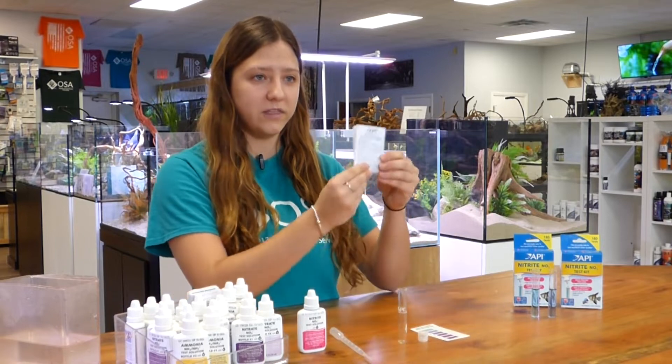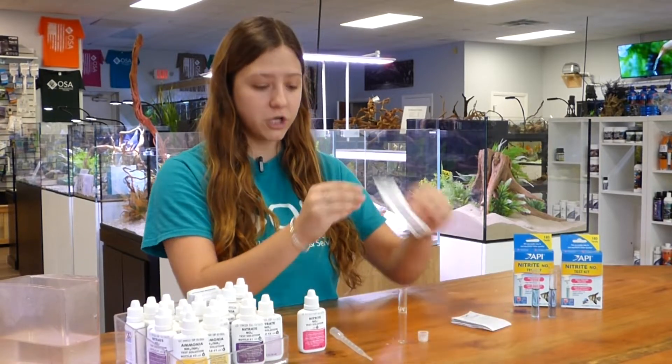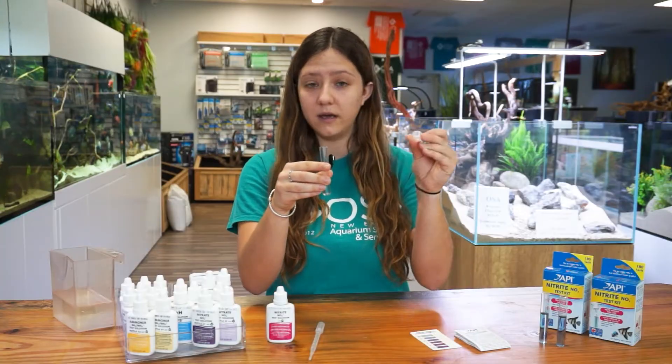Your test kit will come with an instruction manual, a color chart, a test tube, and a cap.